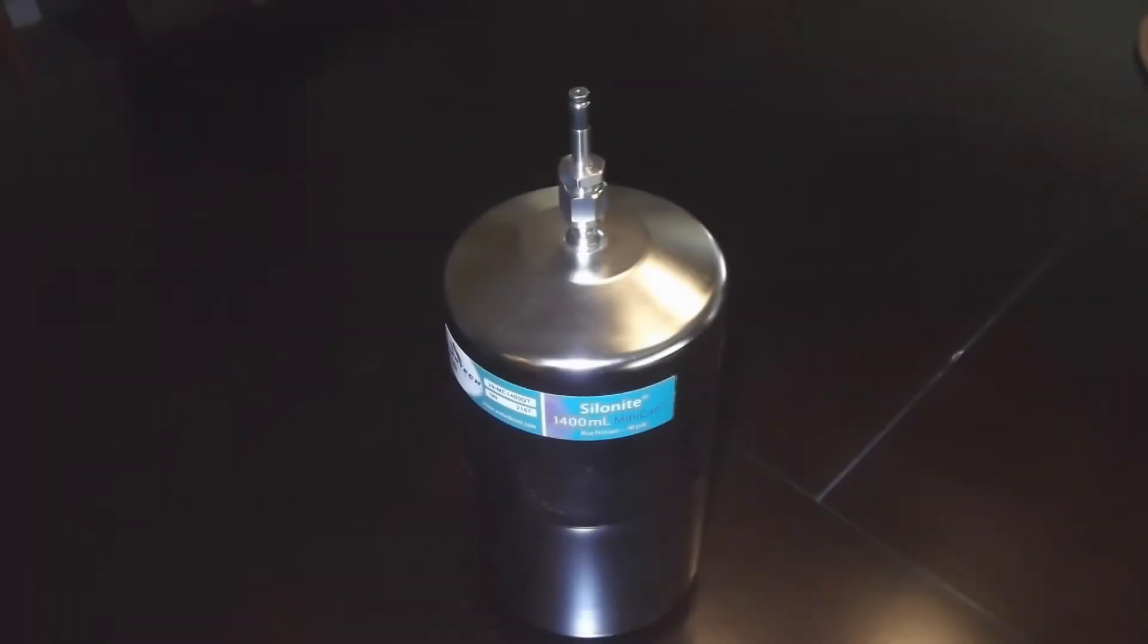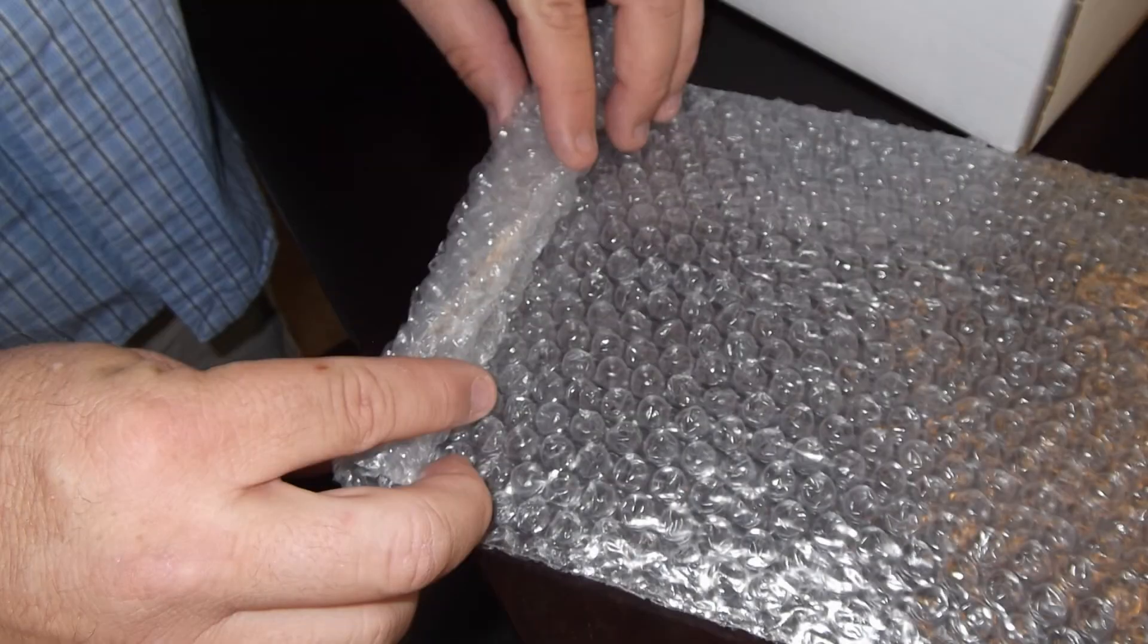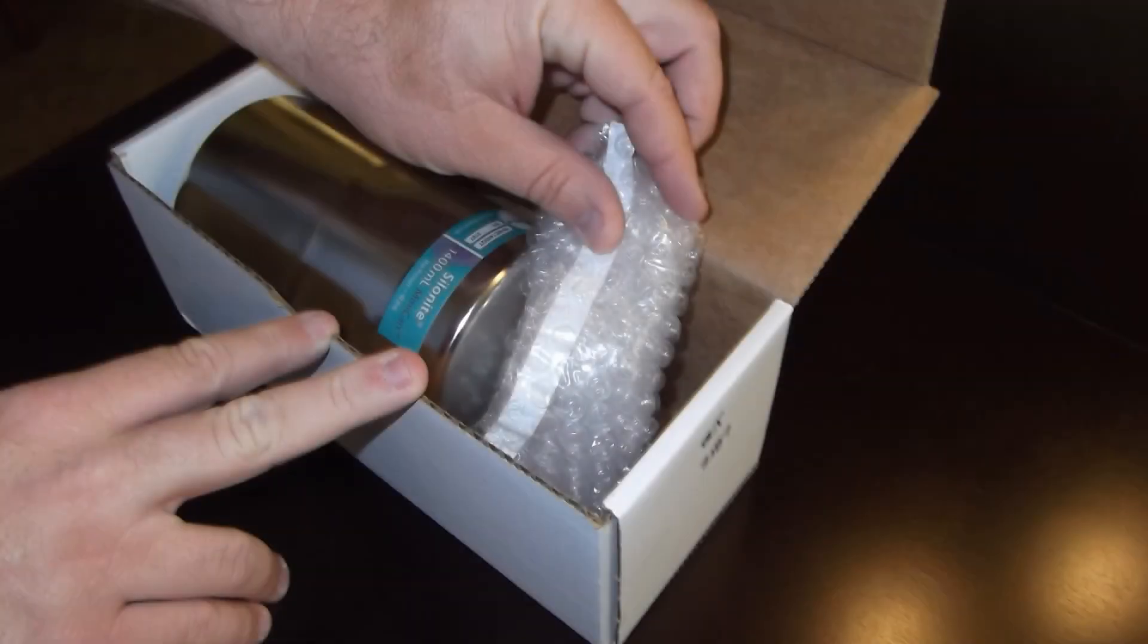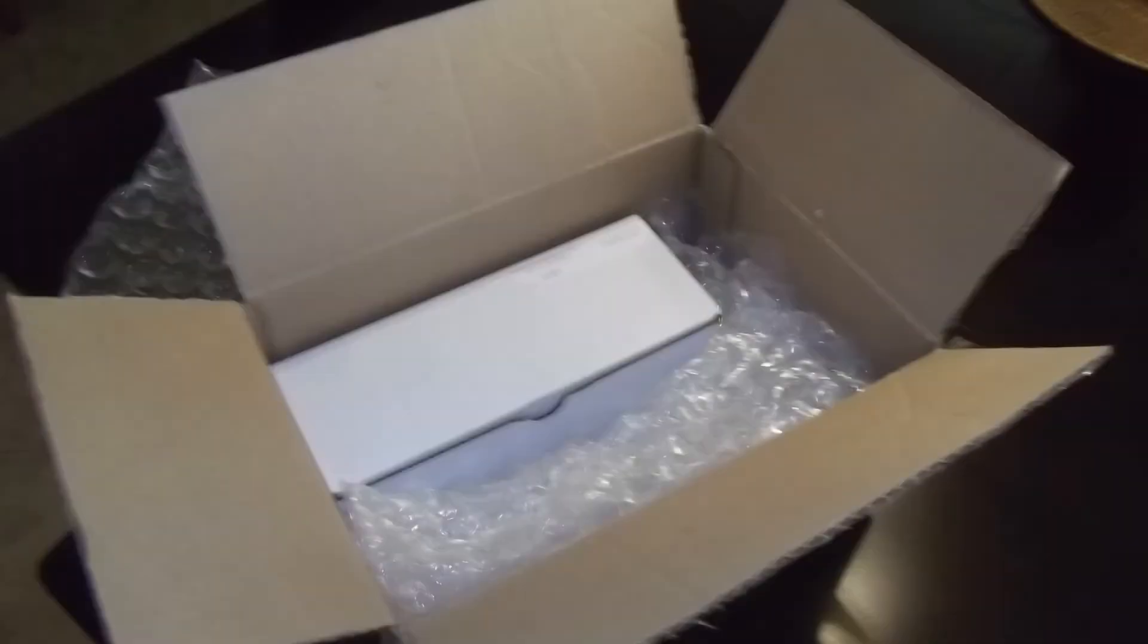Be sure to completely fill out a chain of custody form and place all of the materials back into the shipping packaging just as it was received. Put the chain of custody form into the box with the minican. It is now ready to be shipped to EMSL Analytical for analysis.